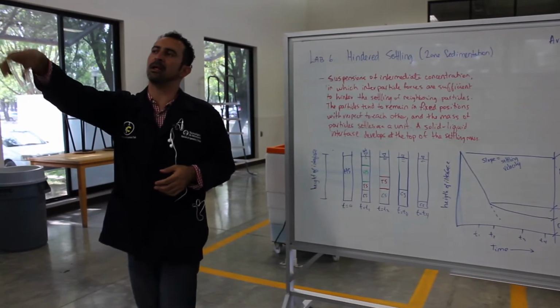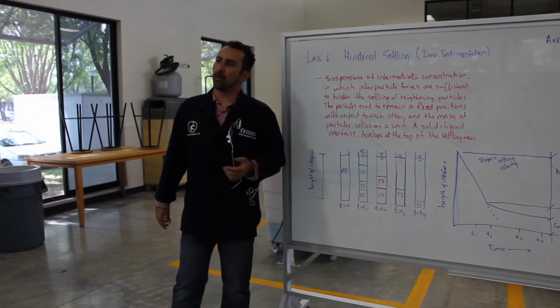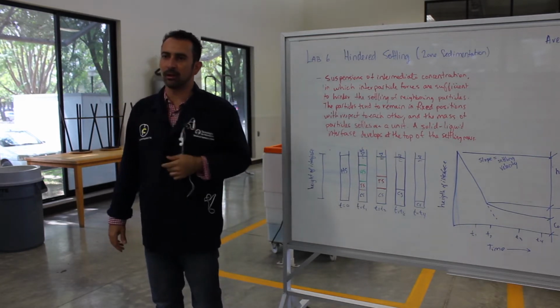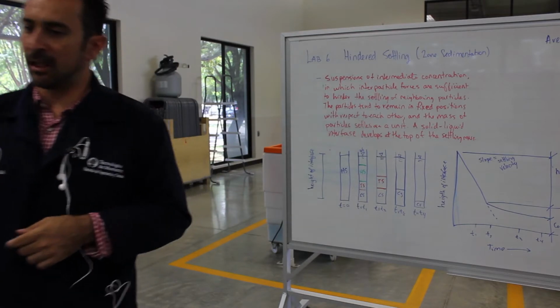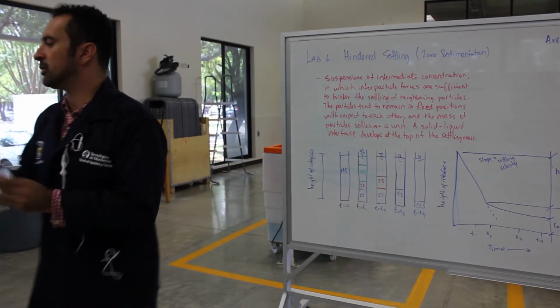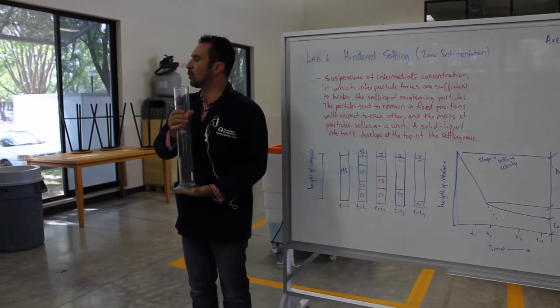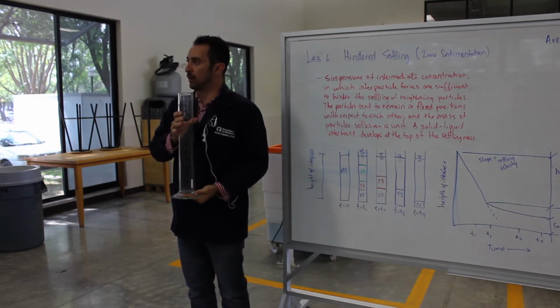Last class we used the big column with 4 ports. It was flocculent sedimentation. Today we're going to use massic sedimentation, so we are going to use these cylinders. We're going to fill them up with wastewater from tank 4. Okay, so remember this.